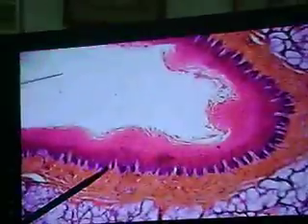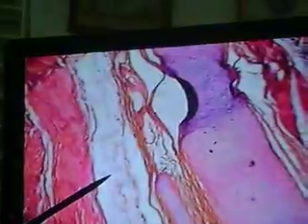But in fact this has two tubes juxtaposed. This is the trachea juxtaposed right here with the esophagus. And this esophagus has a lot of glandular tissue right here. So we're not concentrating on that, we're over in this tube here. And this is smooth muscle, and we're seeing here hyaline cartilage. There are the tracheal glands right here.